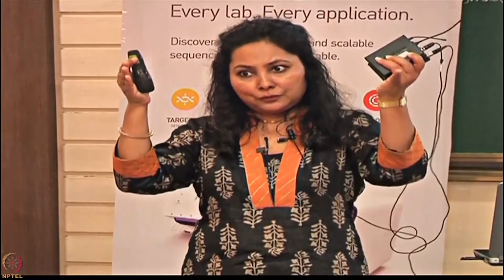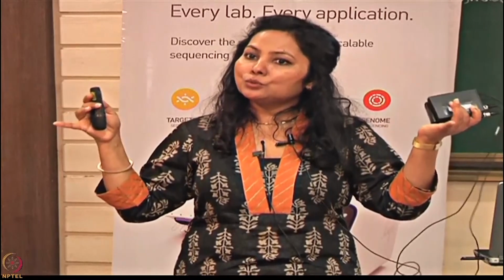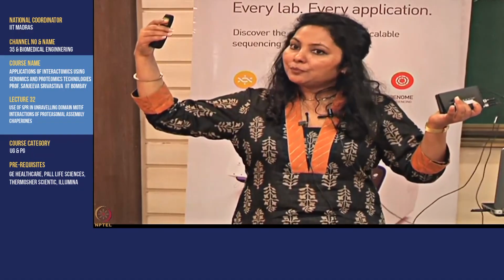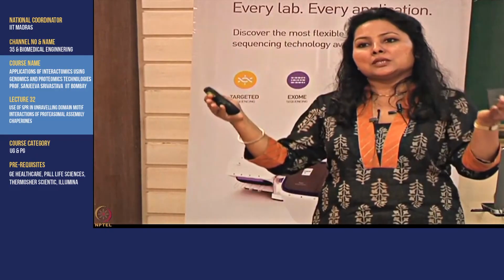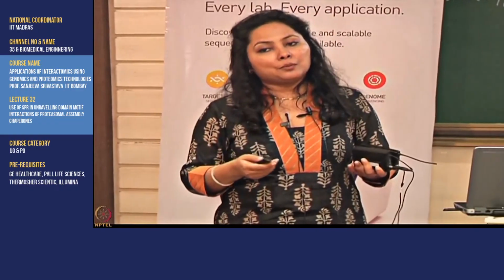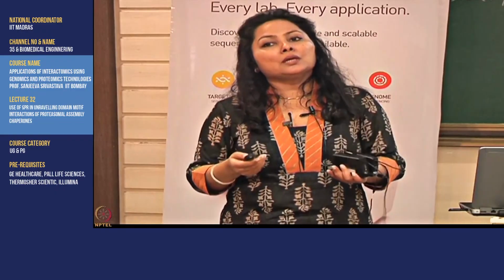You have your fragment of interest in between, you link the adapters at both the ends, and these adapter sequences are coming from a chemistry, and we tell you that these are the adapter sequences, and then the primer comes and sits on these adapters so that you can sequence this region in between. So with library preparation, you are enriching your region of interest and you are ligating these fragments to adapters.